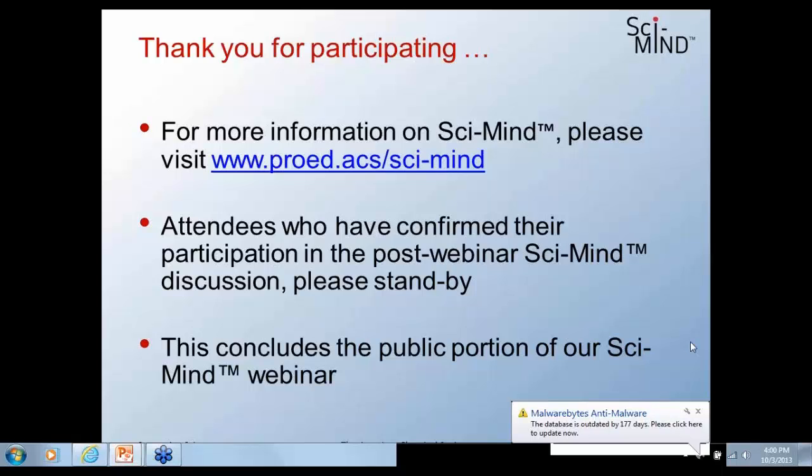But it's a good place to start, at least to give me a feel for what's going on there, again, before I inject them. Are these going to be strongly retained on a nonpolar column? If they are, that may also spur me, if I want to elute them quickly, to move to a more polar column. But it's a good place to start.